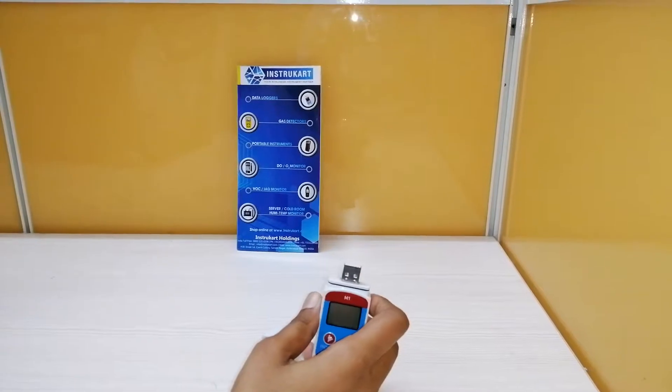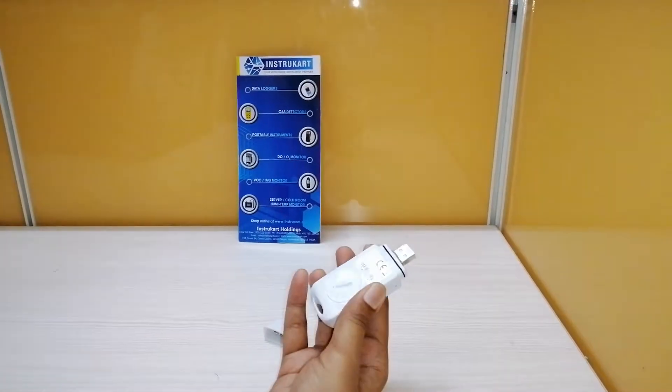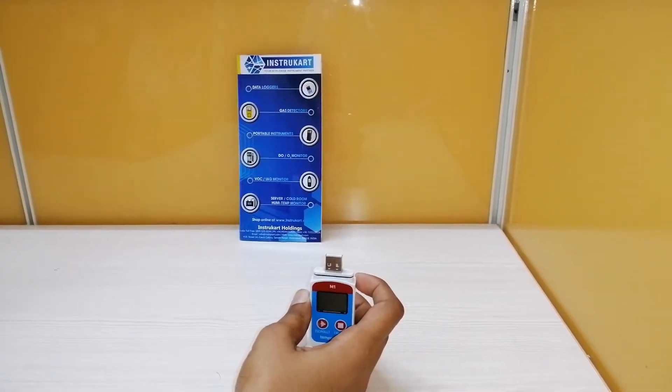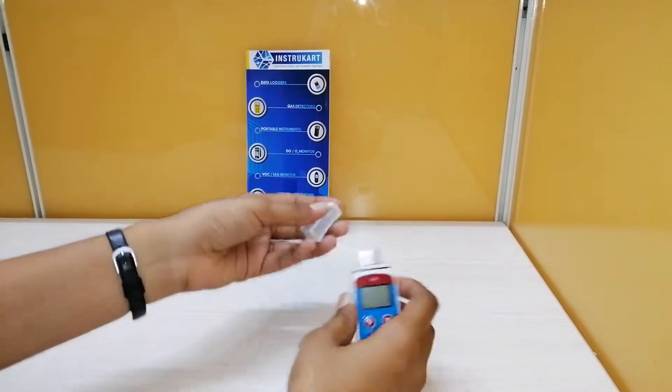The sensor type for this data logger is internal, but based on the application you can also use an external data logger with an external sensor type.